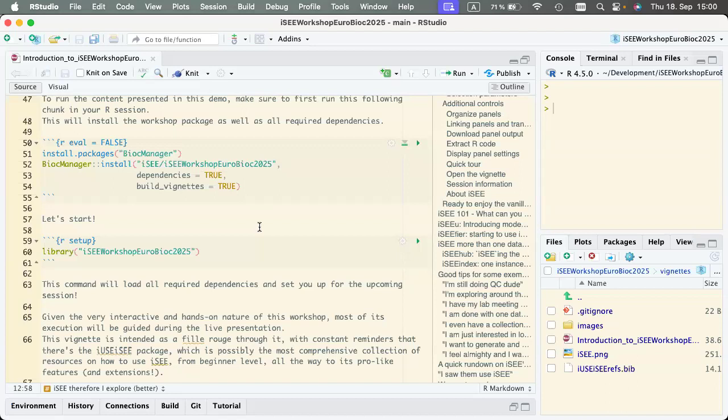You can, let's say, have something in the loop schemes. Okay, more heat maps. Okay, more violin plots. I go with that here because it can be something that could be assimilated to that. You might also want to have some kind of visual representation of tables. They are called Hinton plots, but let's say tables and then tabular representations of quantities. Okay, more volcano plots. Okay, depending on the context that you might need.